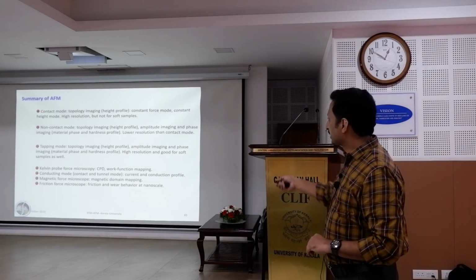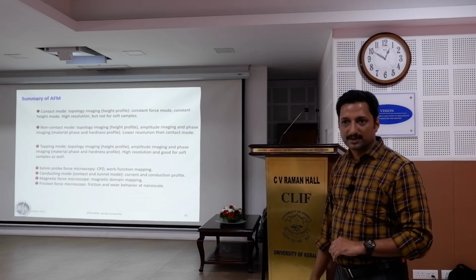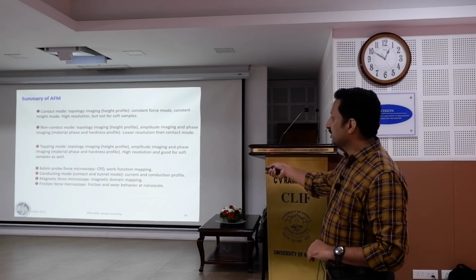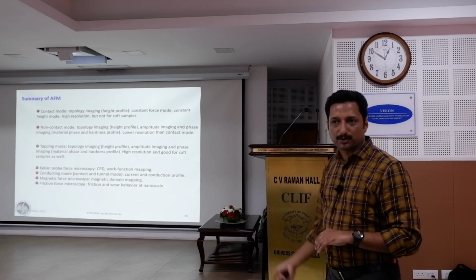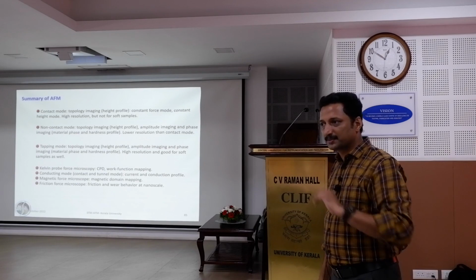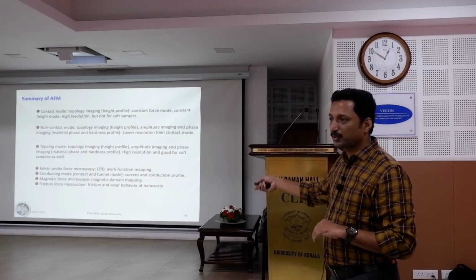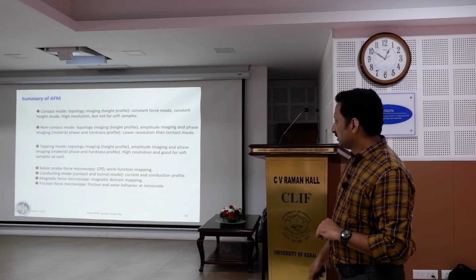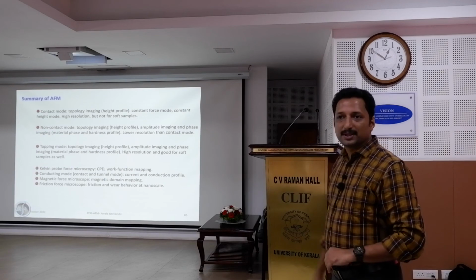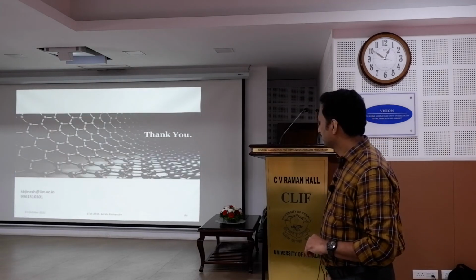At the same time, there are no problems of contact mode, with higher resolution like contact mode. So you can actually combine these things. Tapping mode is safe and better. If you are really working on atomic resolution of materials, you can use contact mode because your sample will be very flat. On the other hand, if it's very rough, go for non-contact mode, or tapping mode is also fine. So these are all the applications of AFM. Okay, thank you.